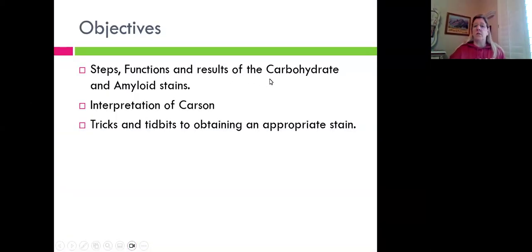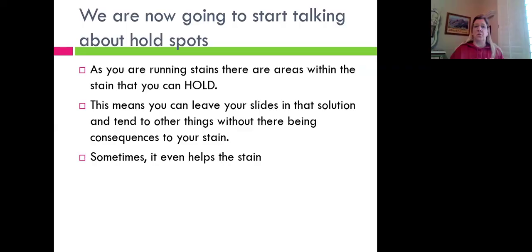So again, we're going to go over all the steps, functions, and results. We're going to do some interpretation of Carson for you. She's going to try to throw you for a loop in certain situations. And then, of course, tricks and tidbits that apply towards the appropriate staining.